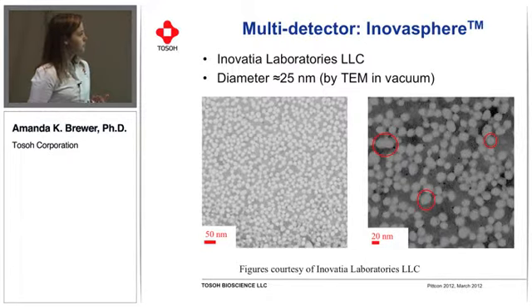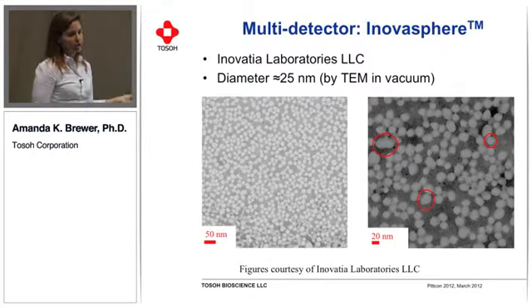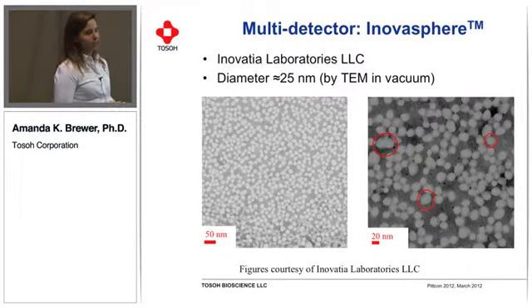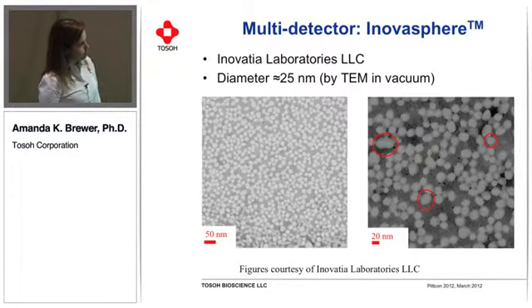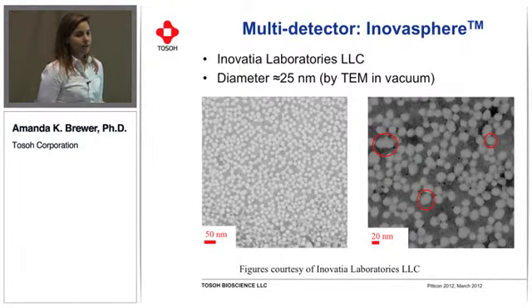They've developed this, it's in an aqueous eluent, so if you differentiate between GPC and GFC, we're moving to GFC here, and so we're dealing with aqueous. And they've been able to characterize this using transmission electron microscopy, and that's what you see here. And if you look closely, I don't know how well you guys can see the pictures, but the ones that I have circled over here, you can see the size and shape isn't very consistent. It seems to vary.